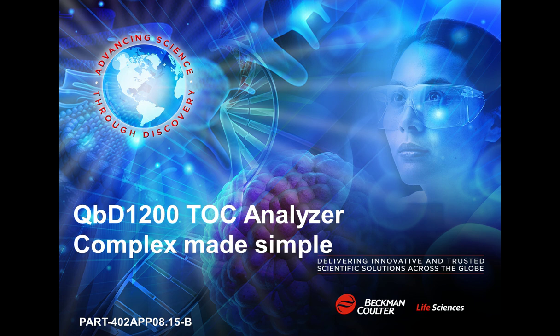Excellent. Thank you very much for that introduction. So, hello everybody. My name's Tony Harrison, and I am a product manager for Beckman Coulter Life Sciences. And today I'm going to talk about validating a pharmaceutical grade TOC laboratory analyzer to the International Committee on Harmonization Procedure, ICH-Q2. Now, ICH-Q2 was written by representatives from the United States, the Japanese, and the European Pharmacopoeia, and it contains guidance on how to ensure that a TOC analyzer is fit for purpose and for providing batch release data.